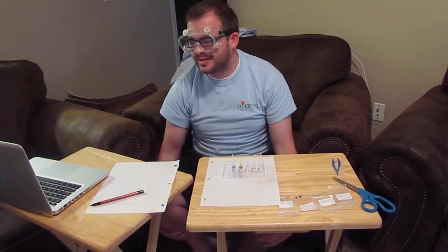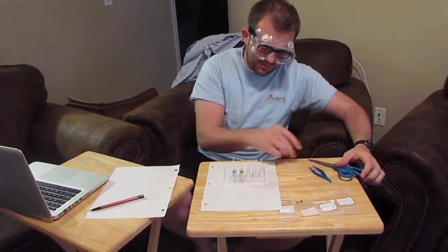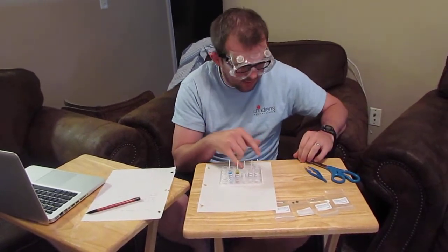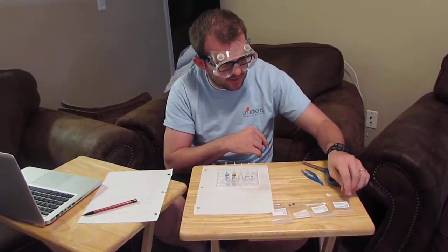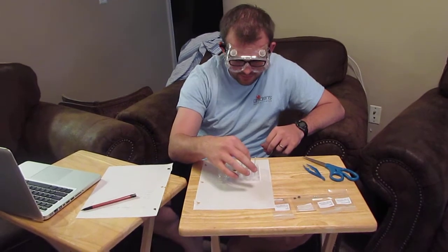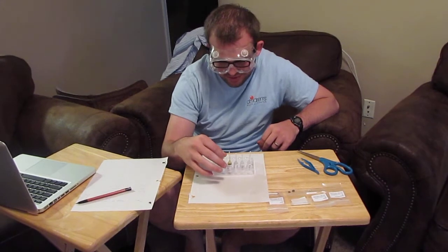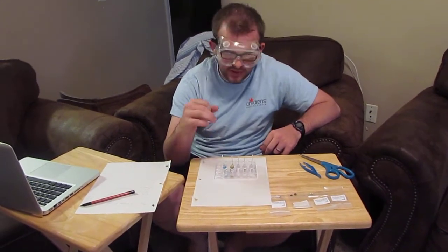Alright, this is Jonathan Wallace here to do lab number 2, Oxidation Reduction Activity Series for chemistry. I've got all my materials, my safety goggles, my tweezers, my scissors, so that I'm going to be able to open up the chemicals. I've got my metals: magnesium, zinc, lead, and iron. I've also got sodium sulfate, magnesium sulfate, zinc nitrate, iron 3 chloride, and copper 2 sulfate.